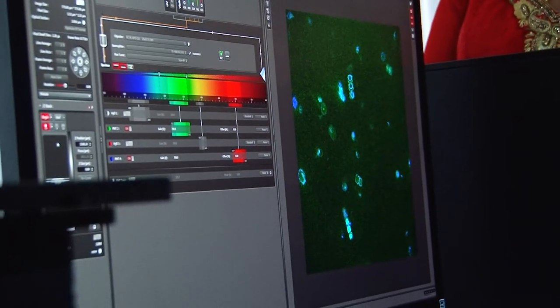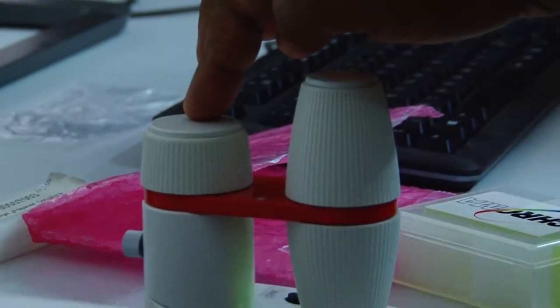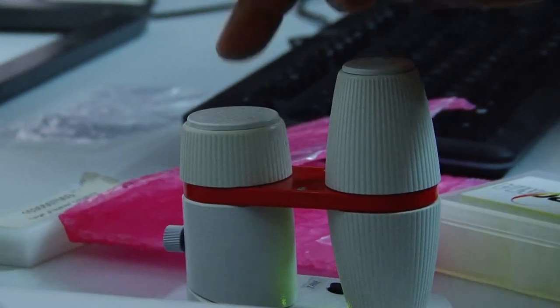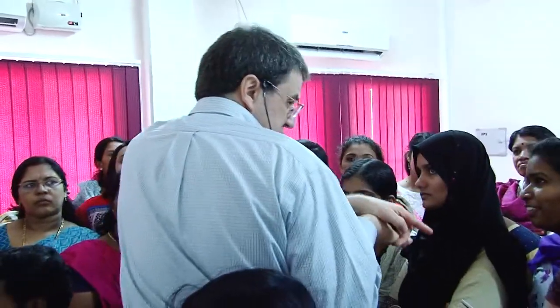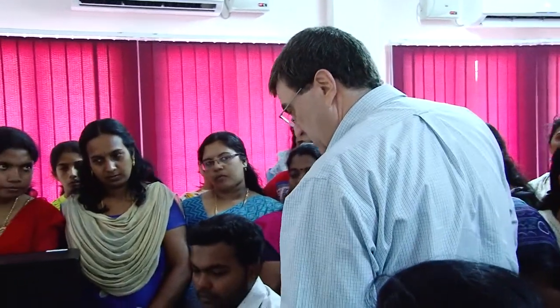Okay, so what we're doing is we're picking our range, right? And then what are we going to call those planes we take? A Z stack, right? Like a deck of cards. And then when he did the 3D thing, what do we call that? It's got a name. Two names. You can either call it something that starts with a P. R, yes, a projection, right? That's a 3D projection, good. Or sometimes we'll call that a rendering. So you pick the other bottom or whatever.